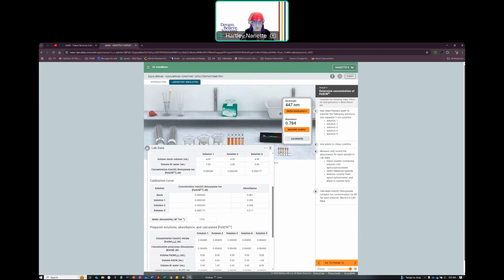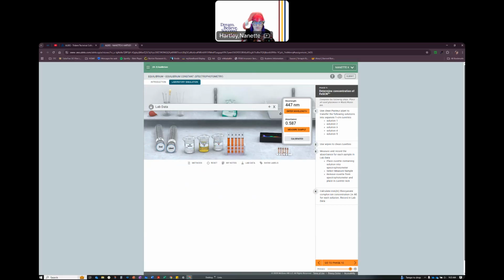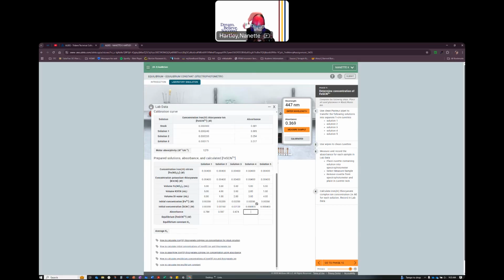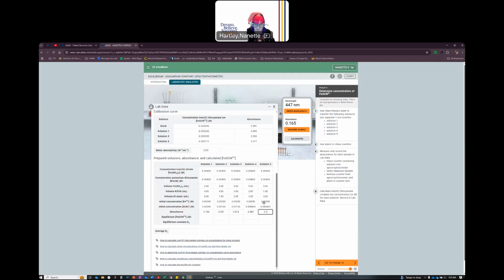Can take this one out, this one in, measure that, 0.587. 0.474. 0.369. And 0.165.